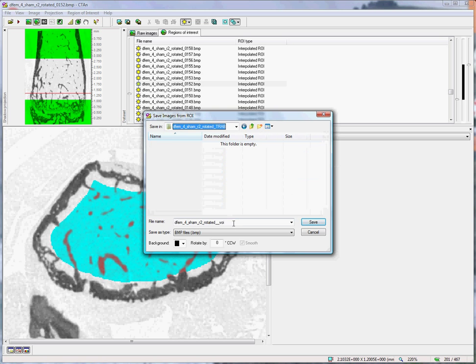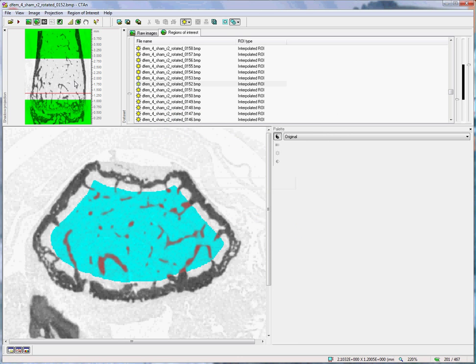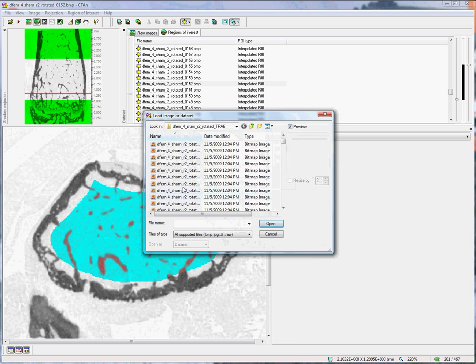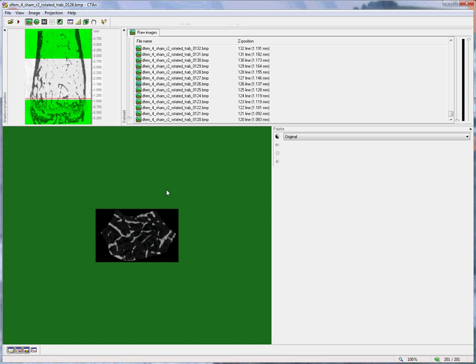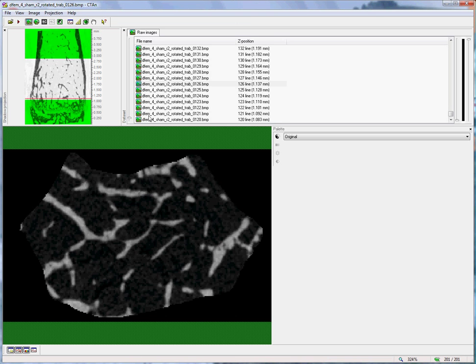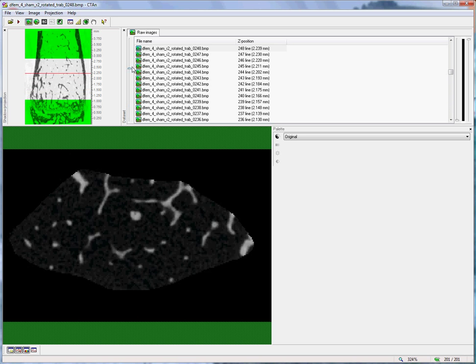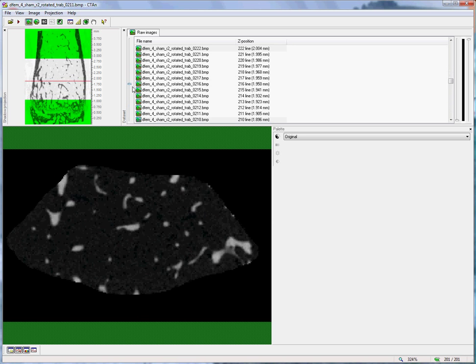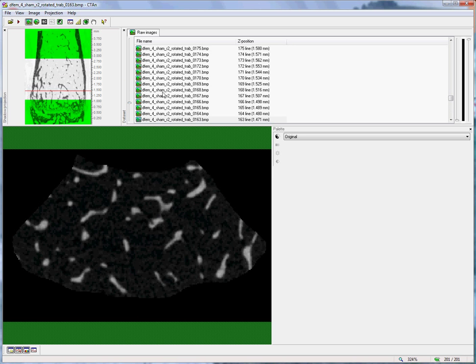and we will give the files a prefix accordingly. And we will save a new dataset, which is much smaller than the original dataset, and it contains just the bone within the trabecular volume of interest. This smaller region of interest is much more convenient to perform analysis and model building on.